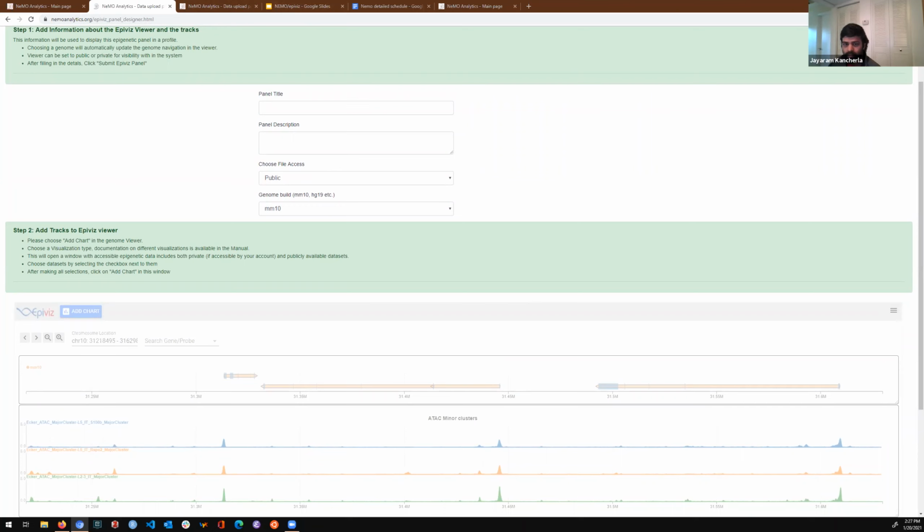Does anyone have any questions? Jerome, there's a question in the chat. Yeah, I'm looking at it. Can we add external annotation tracks? Yes. So through the upload interface, as long as you know where that external file is stored, you can add that external file and then you can create tracks based on that.